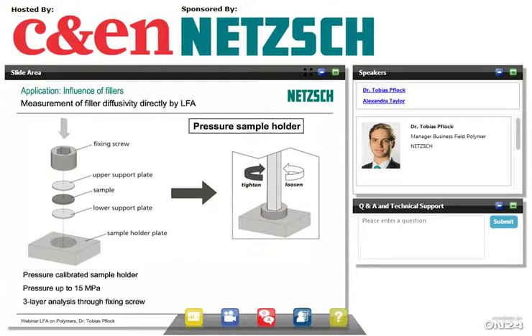So whenever you have delamination, you will see that the thermal conductivity decreases. Let's say you heat up your sample and you get delamination, there will be jumps in your signal. Delamination could be a very good reason for this to happen.